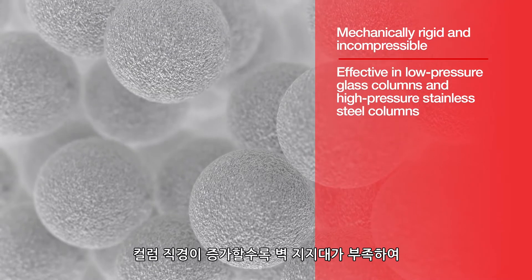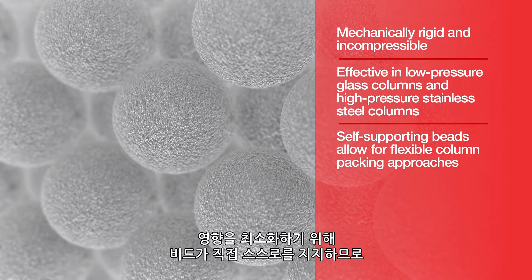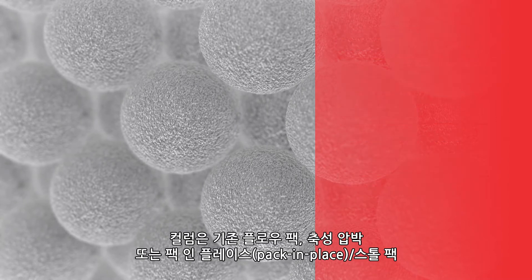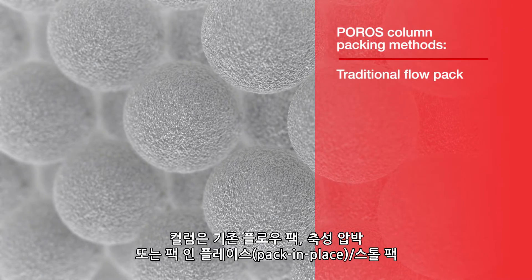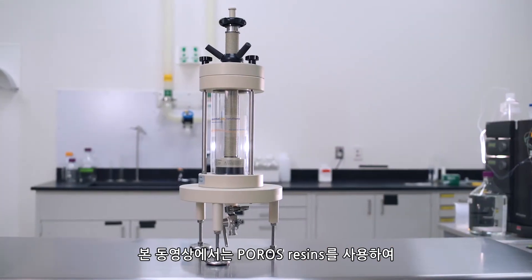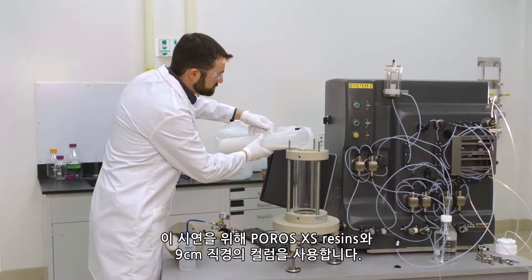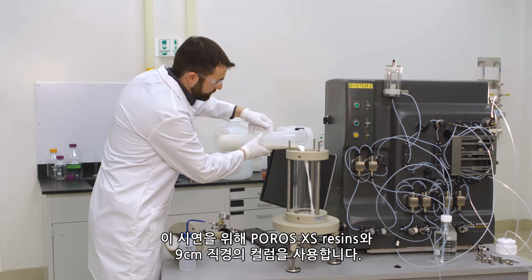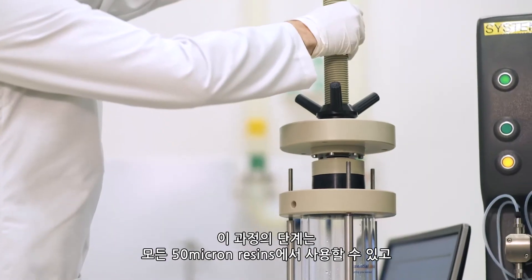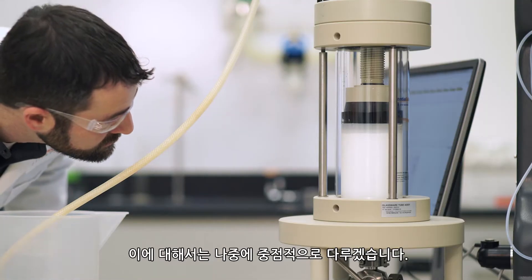The lack of wall support with increasing column diameter has minimal impact because the beads support themselves, allowing for flexible column packing approaches and consistent and robust results. Columns can be packed with traditional flow pack, axial compression, or pack-in-place stall pack packing methods. This video will walk you through the process of packing larger scale columns with Poros resins, utilizing Poros XS resin and a 9 centimeter diameter column. The steps can be used for all 50 micron resins with minor differences in the packing factor, which will be highlighted later.